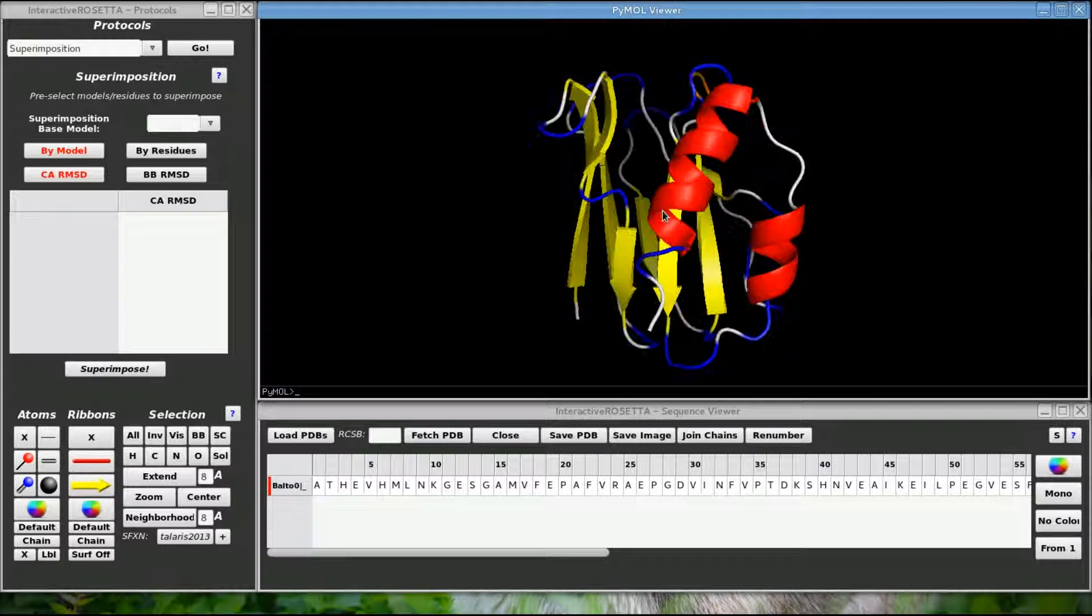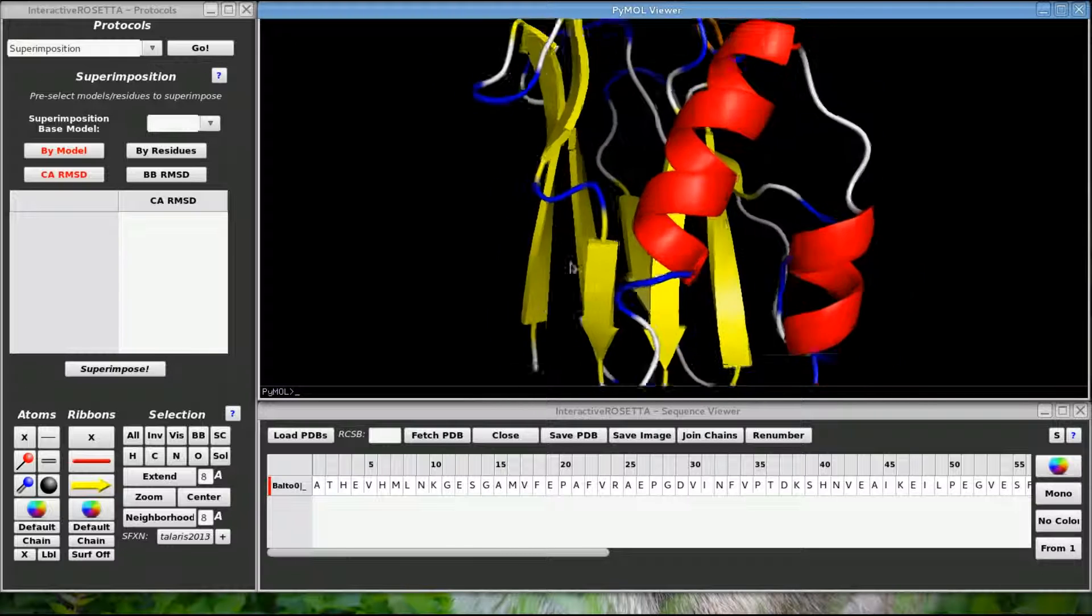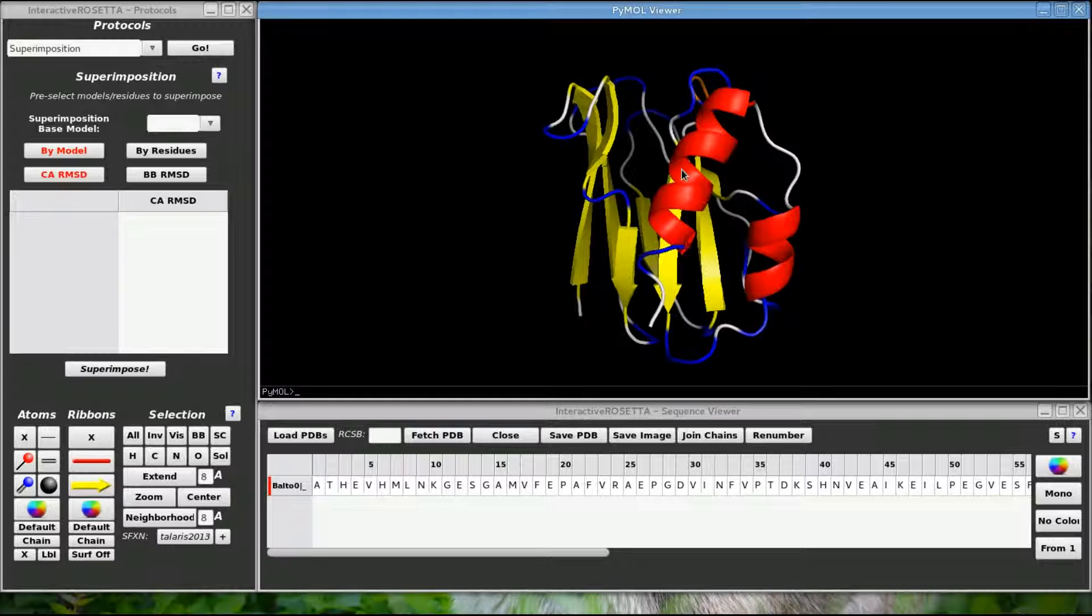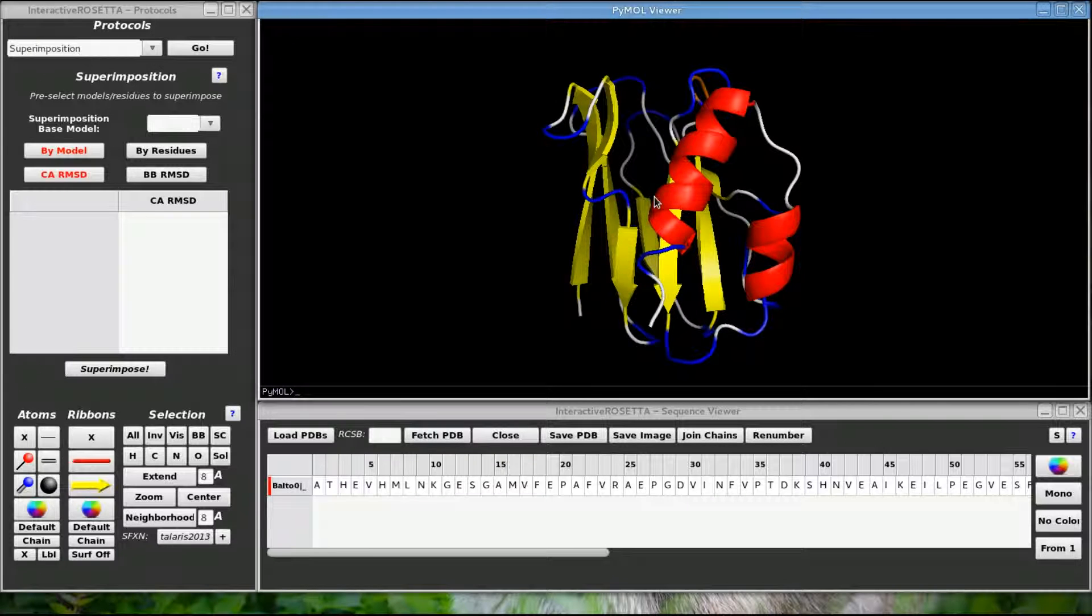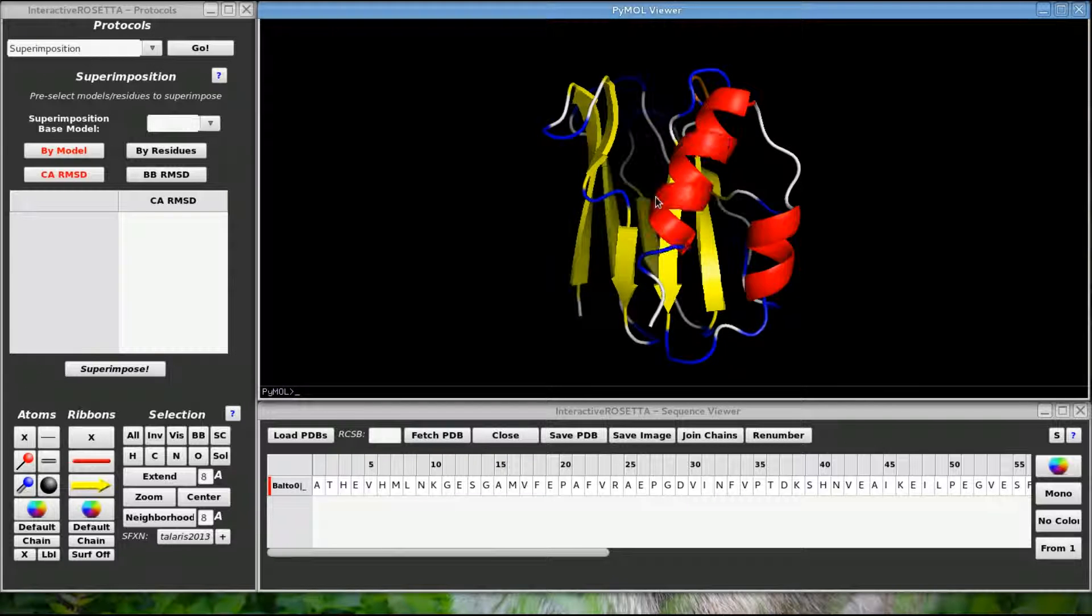To zoom in and out, you need to right click, hold, and then drag the mouse. Using the mouse wheel does not zoom in and out but instead changes the Z clipping, which just basically alters how much fog is in the viewer.